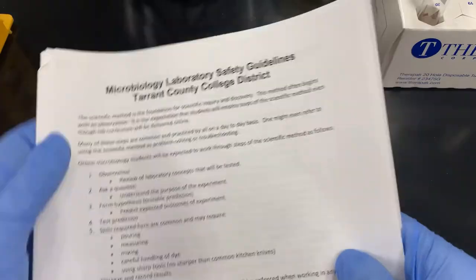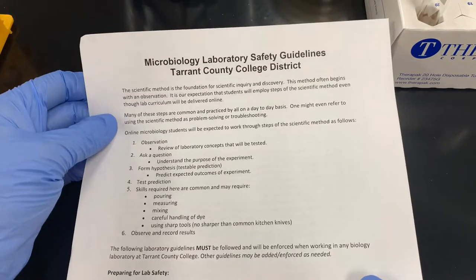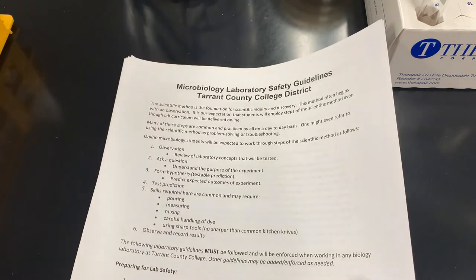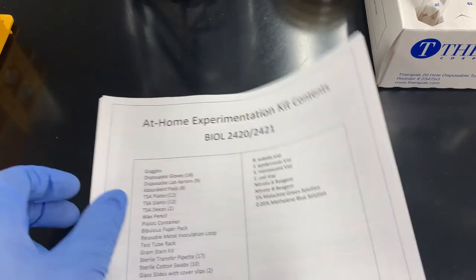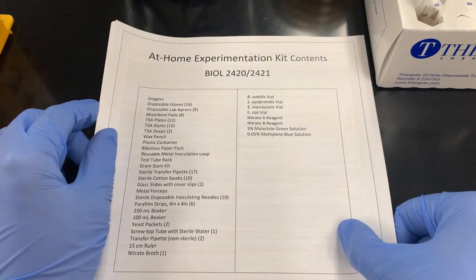The first thing you're going to notice in your lab kit is paperwork. These are the laboratory safety guidelines. Please, please read through these again. Make sure you understand all of them. I know you already read through them once, but we need you to read through them again. It's very important. Along with that, you're going to find the kit contents for what comes in this kit.